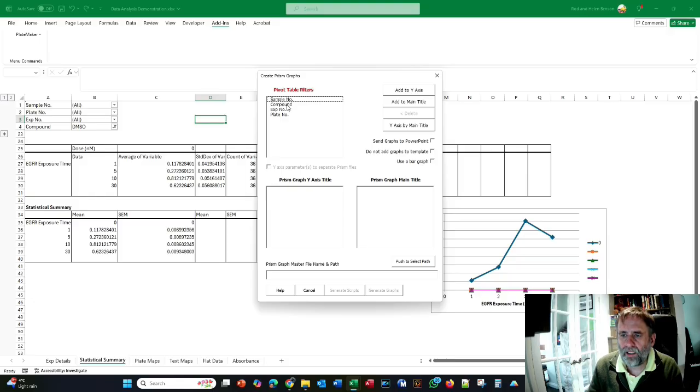If we want it that way, we would do experiment first and then by compound, and then all the experiments are grouped and then by the compounds. Or do we want compound 1, experiment 1, 2, 3, compound 2, experiment 1, 2, 3, compound 3? I personally would like it the other way around. I personally want compound 1 and then my 3 experiments, compound 2 and my 3 experiments, compound 3. So because I want it that way around, I'm actually going to swap it around.